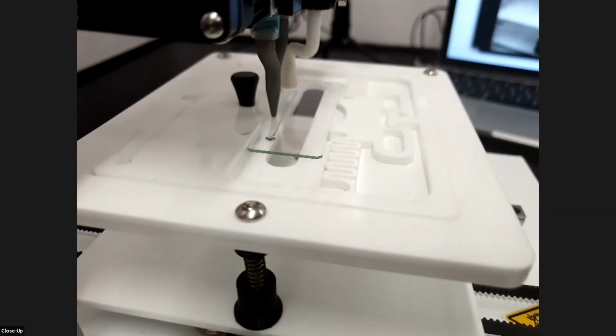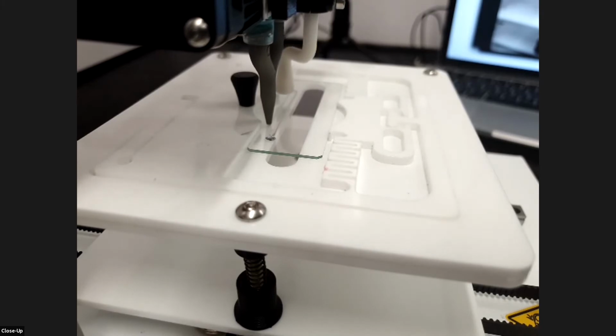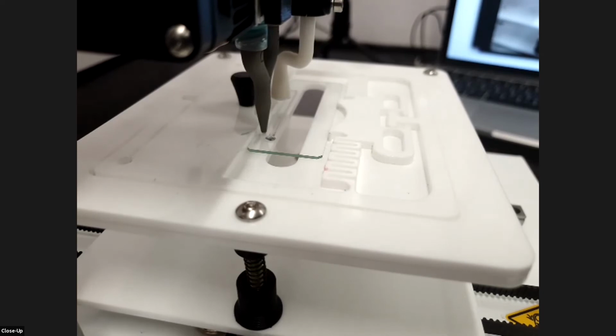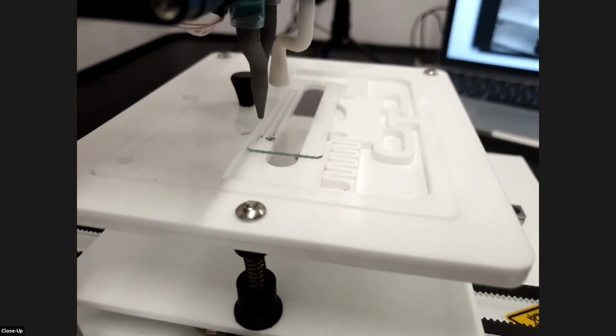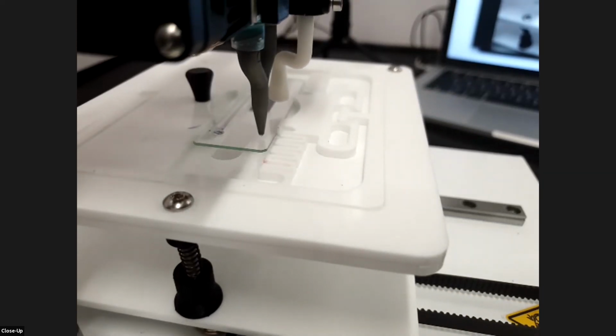Once this line finishes, it'll move to a two-layer scaffold, one of the more common structures printed during research of tissues and cell printing. This lattice will also be a coaxially printed lattice, with the core fully encapsulated.